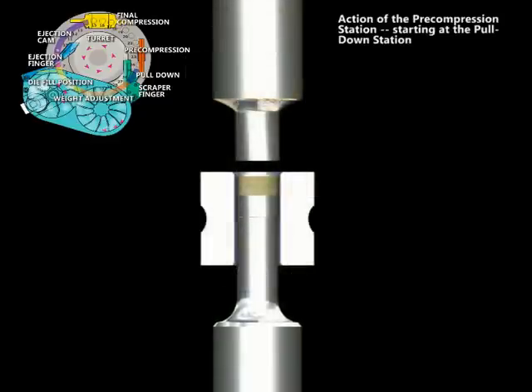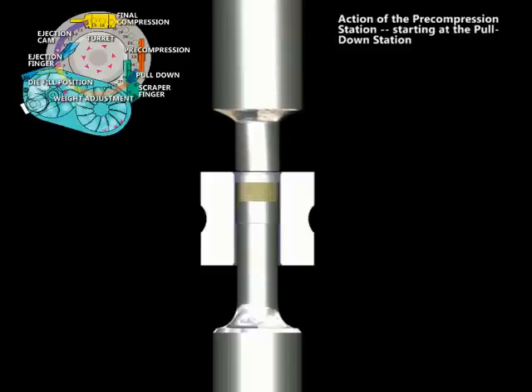The lowering of the powder column prevents any powder from being blown out of the die as the upper punch enters the die bore, thus preventing variations in tablet weight.